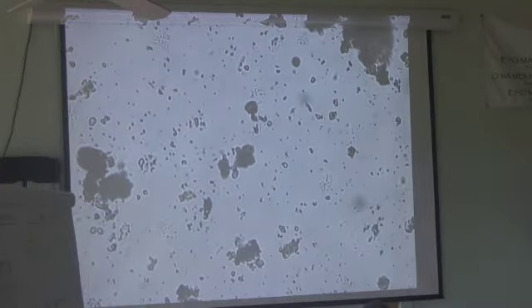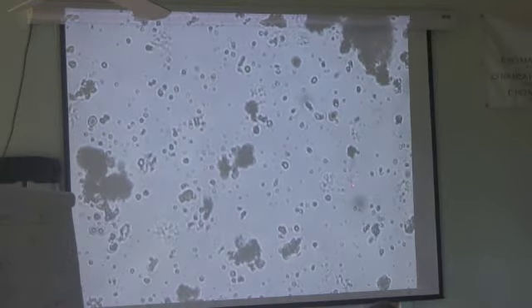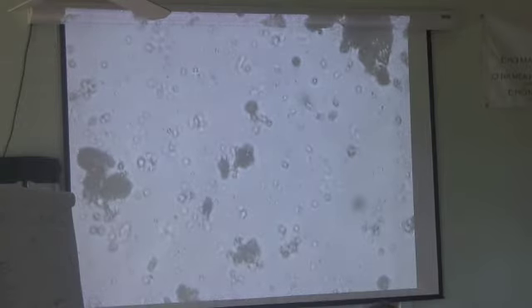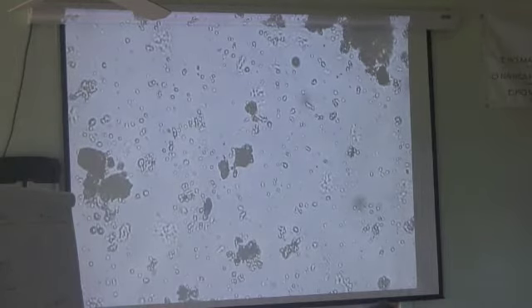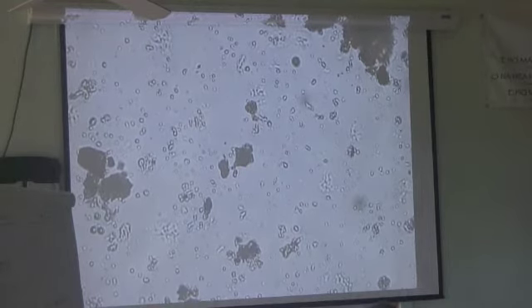If you want to have a category for spores, go ahead and put in a fungal category, spore, and go like one little brown guy. And that's about all I've seen in this field. We've got lots of that. Oops, there goes a second flagellate. There's a third. Wait long enough, you get four. So you can see why you want to keep your counting down to kind of a minimum, or you keep accumulating on them. But you've gotten in here, so this is great.